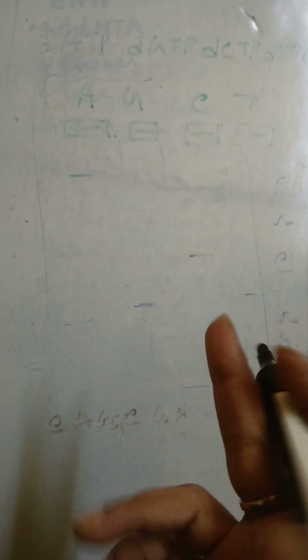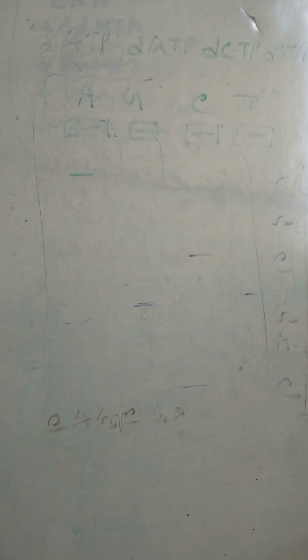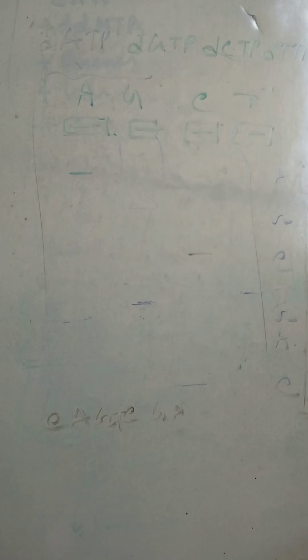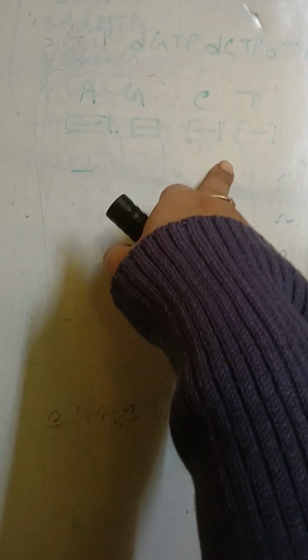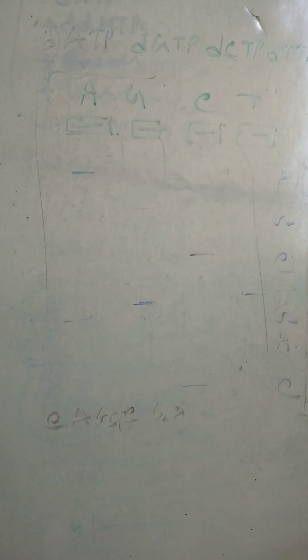So this is the sequence of the DNA you want to sequence, and you will get it from the complementary one. As these sequences are complementary, they are the complement of the sequence of interest, the DNA of interest. So you have just reversed it. You will always read from the bottom to the top of the gel and write it down in this way. So we will get the sequence.